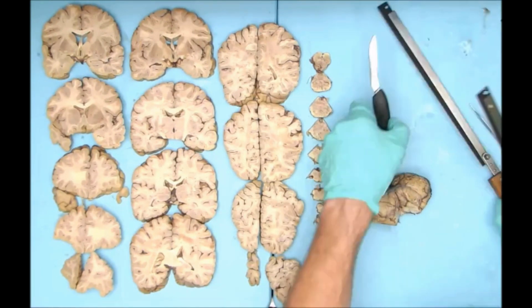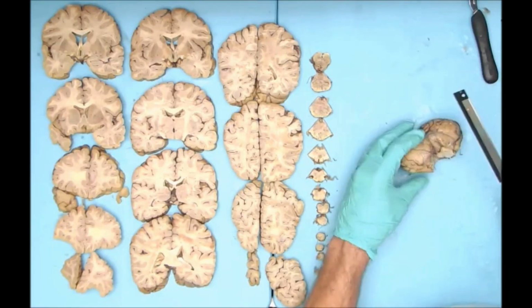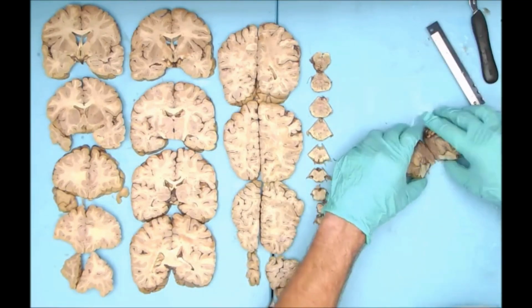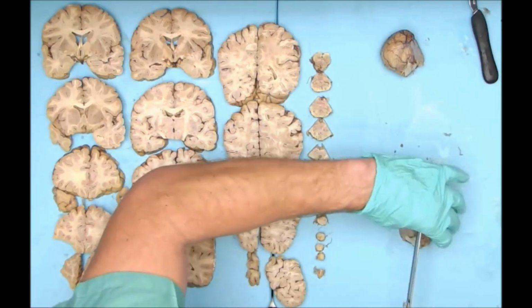Now I'm going to divide the cerebellum into the right and left halves, and then I'm going to perform more of a sagittal cross-sectioning of the right and left sides.